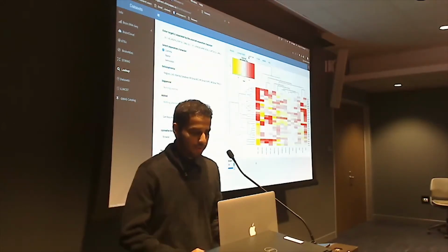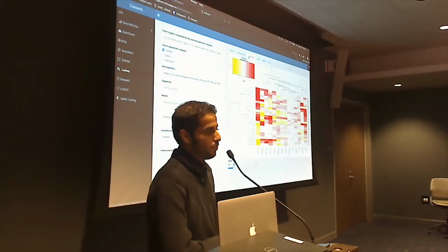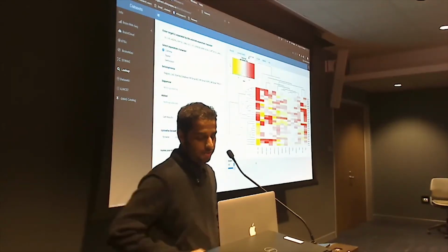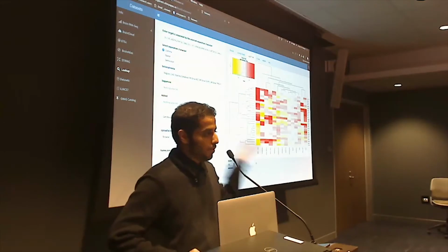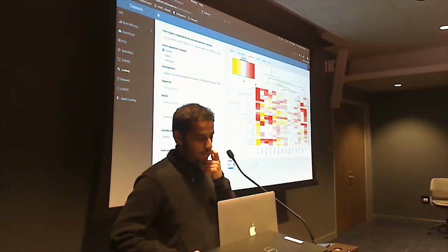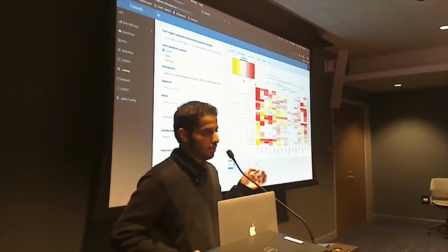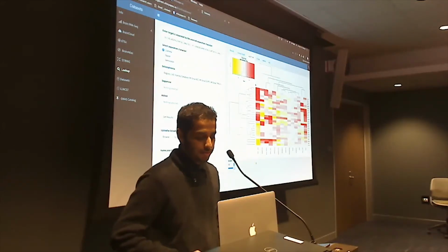There you go. So this is a heat map for the log fold change between control and schizophrenia for each target gene that we got from the network, and for each data set that we put in the NVIS schizophrenia module. So red means the fold change has positive values, which means that it's upregulated in schizophrenia patients compared to the control.